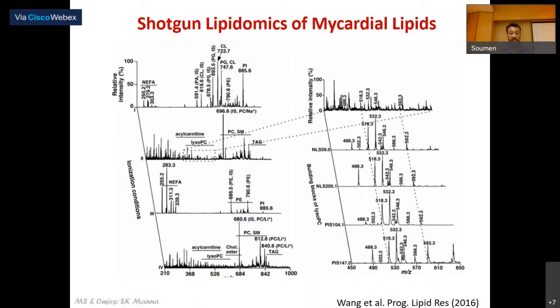The reason is that, as we discussed, in the case of lipidomics as well as, as we will see, in proteomics, because they are so complex, you will have many different kinds of lipids coeluting or eluting very closely to each other. So within the same envelope, you have to really keep on scanning through the whole mass range and fragmenting them again and again.